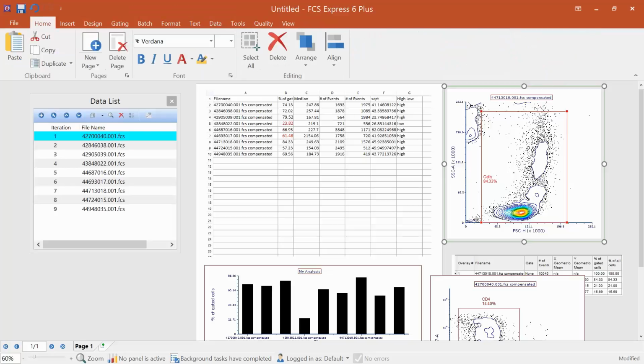So again, with spreadsheets, you can integrate different gating positions between samples. You can have all the samples open at the same time. You can have one at a time. I mean, we've tried to account for really every possible variation that you could encounter or way that you may want to work with data in FCS Express.